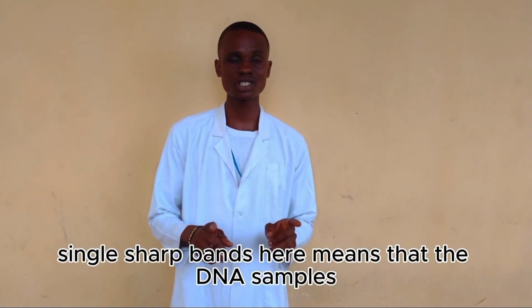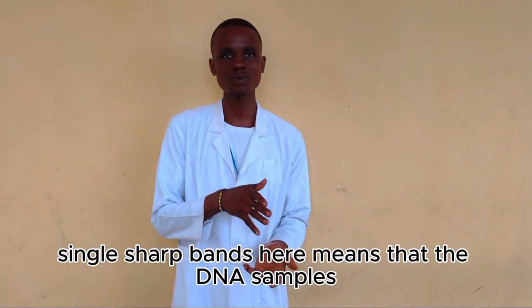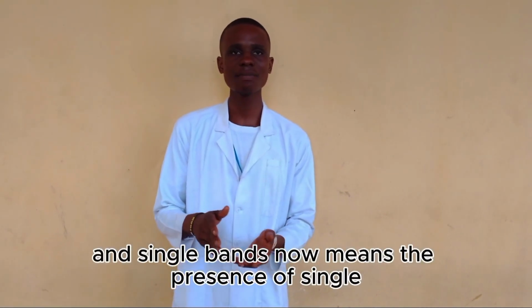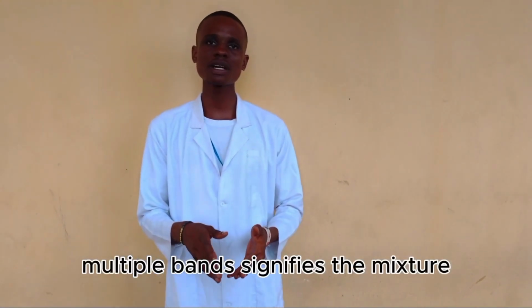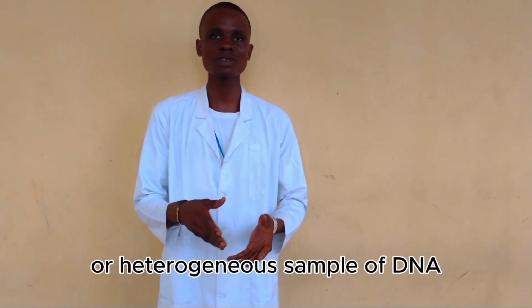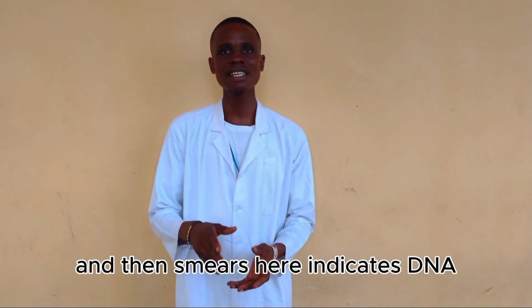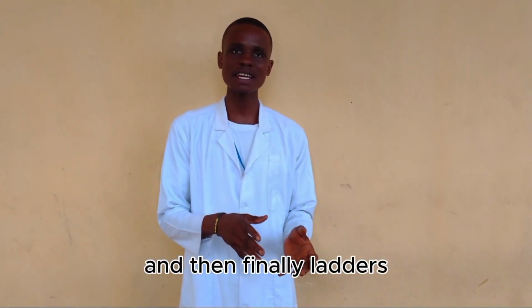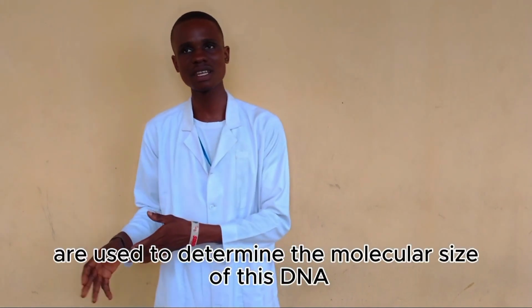Single sharp bands mean that the DNA present is intact, and single bands can also mean the presence of single fragmented genomic DNA. Multiple bands signify a mixture or heterogeneous sample of DNA, and smears indicate DNA degradation or contamination of DNA. And then finally, ladders are used to determine the molecular size of the DNA.